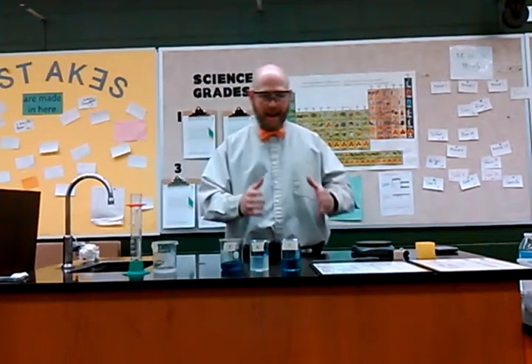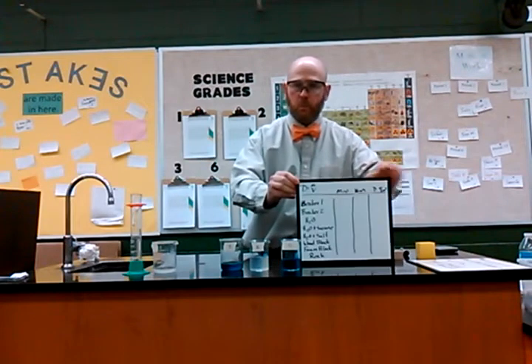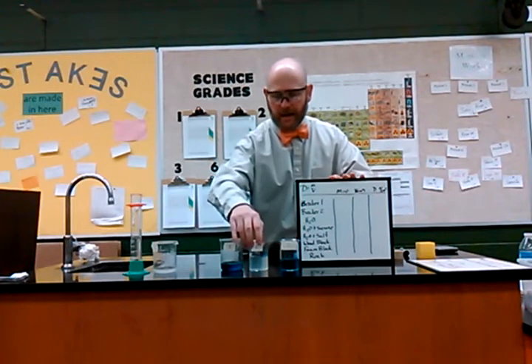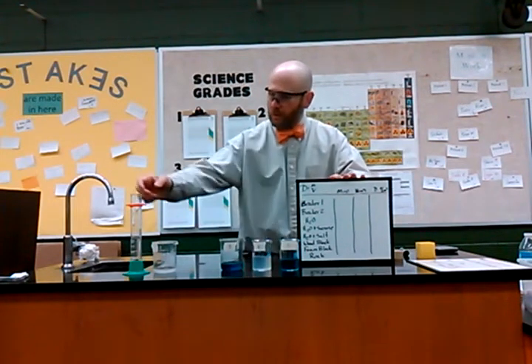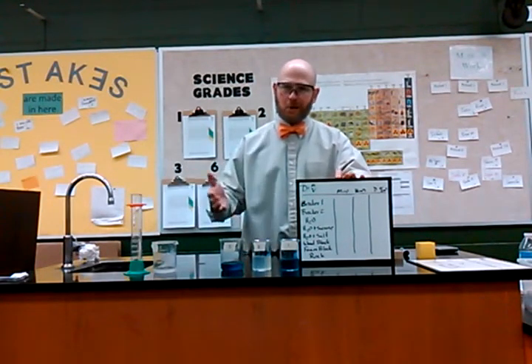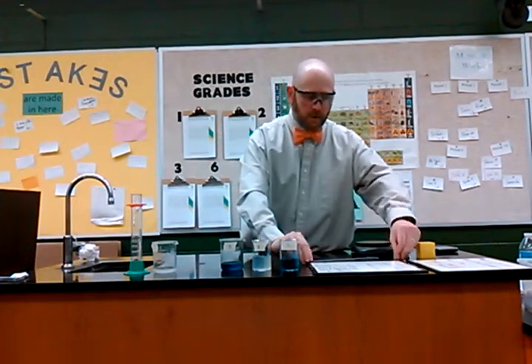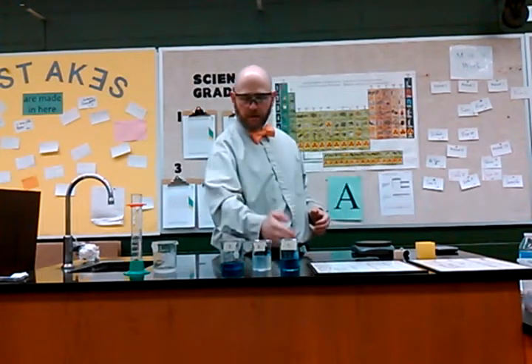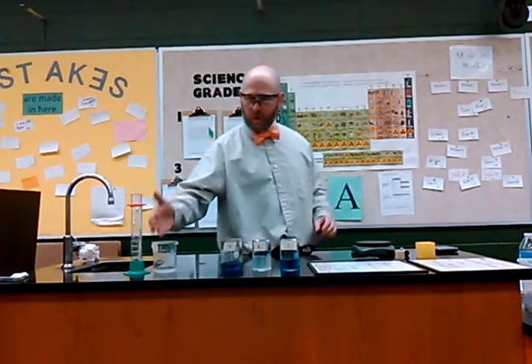We have taken the mass and the volume of several different objects. We need to know the mass of beaker 1 and 2 in order to subtract that when we calculate the mass of the fluids that are in there. We use a graduated cylinder to calculate the volume of an irregularly shaped object. You now have enough data to calculate the densities of the liquids and of the two cubes as well as the rock.